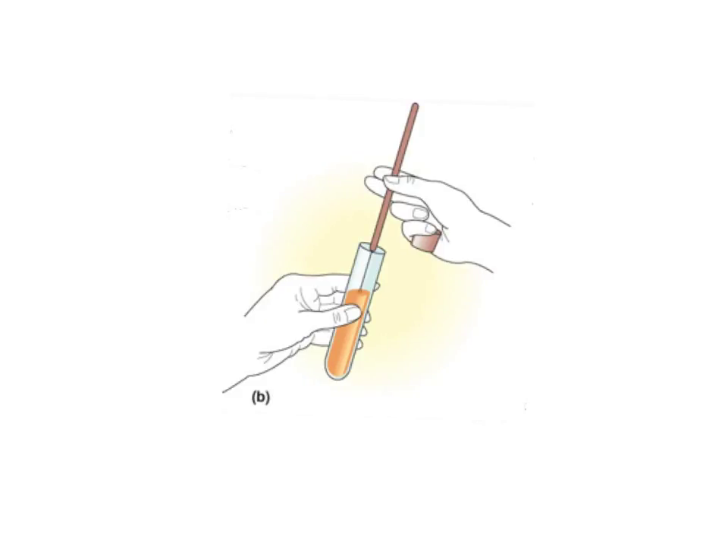When the loop has cooled down briefly, you dip it into the mixture of bacteria that you're going to sample, or it might be that you wipe it on the desk, a door handle, or wherever you want to take the bacteria from. The inoculating loop is now dipped into the bacterial mix or wiped onto the surface that you want to check for bacteria. Inoculating is just a kind of posh word for injecting, that sort of thing.